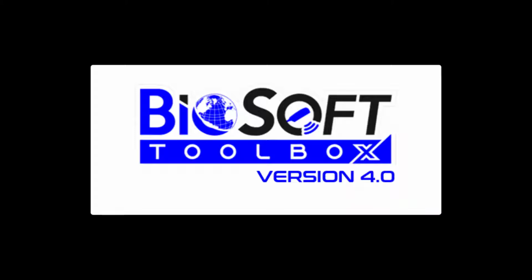I want to talk to you about some of the features of BioSoft Toolbox 4.0. It is set up to run very similar to previous versions. It is a software that is completely new as far as libraries and a lot of the processing from the previous versions of Toolbox that we've had.